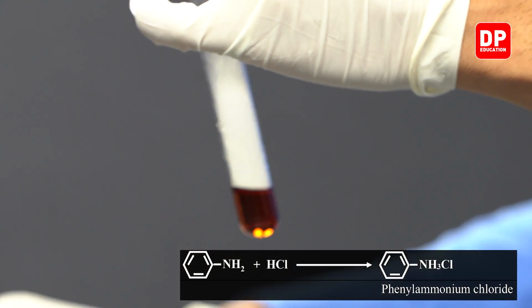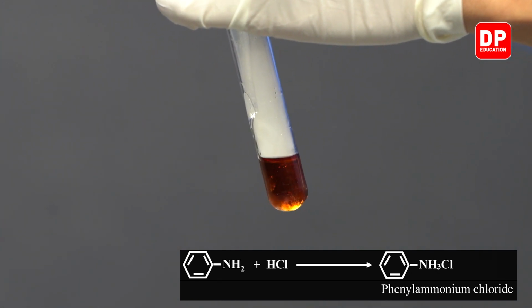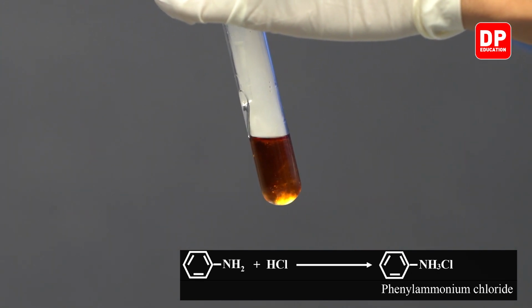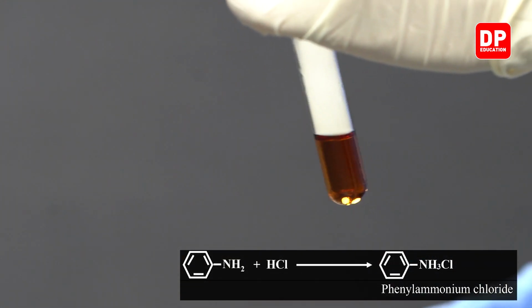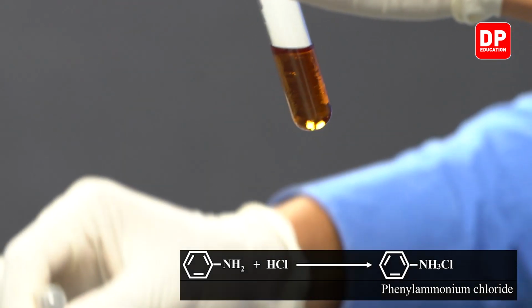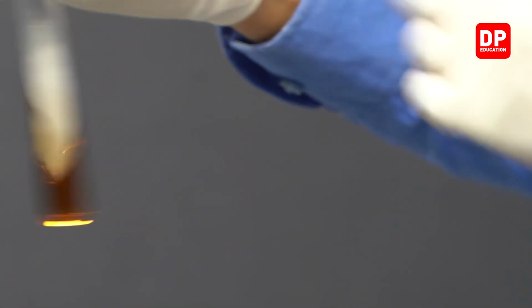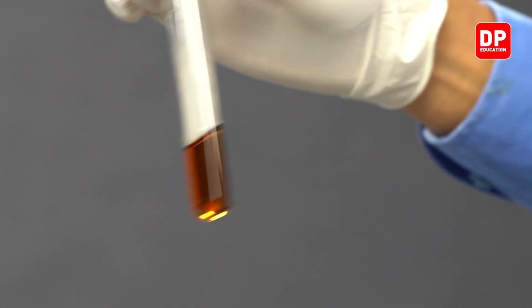We have to add about 3 cubic centimeters of concentrated HCl. As you can see, we have completely dissolved the aniline that we had in the test tube. Now we have produced a salt, which is anilinium chloride, in this test tube.